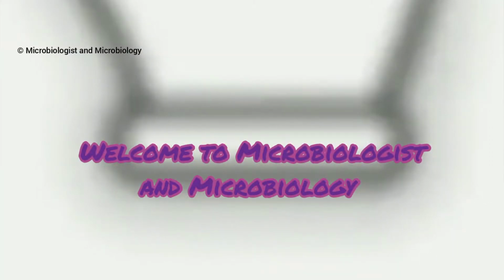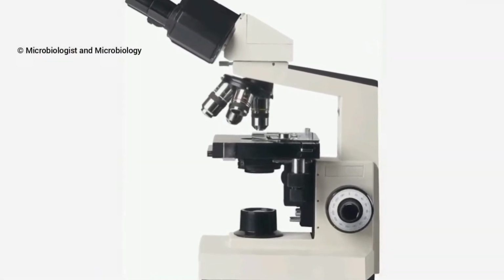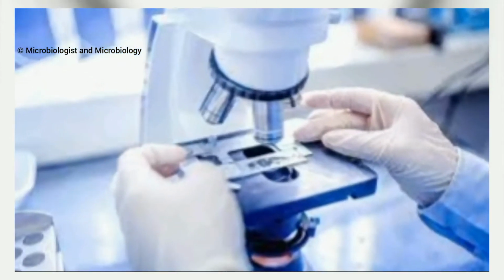In this video we will discuss the microscope. As a science graduate or a student, you must know about the microscope, its function and properties. A microscope can be used to observe small objects that are too small to be seen by the naked eye, even cells.